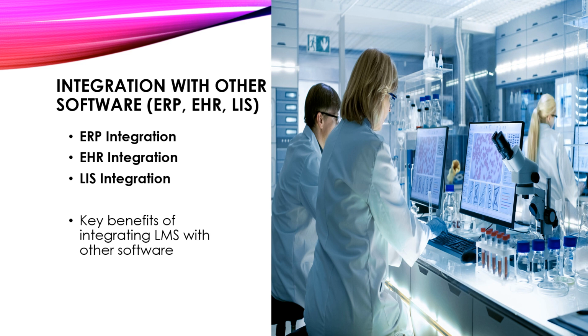How about EHR integration? EHR systems contain patients' health records, including medical history, test results, diagnosis, and treatments. Integrating LMS with EHR ensures laboratory test results are directly imported to the patient's electronic health record. And this integration improves care coordination, reduces errors associated with manual data entry, and provides healthcare providers with comprehensive patient information in one centralized location.